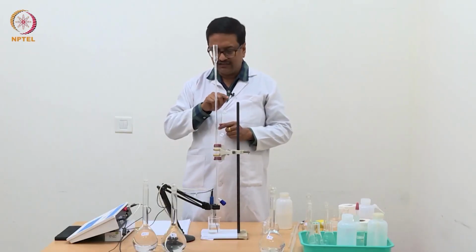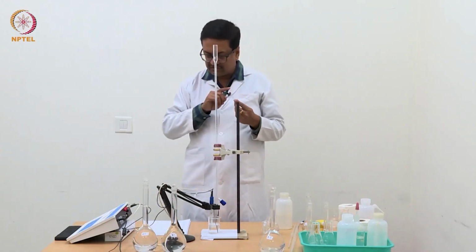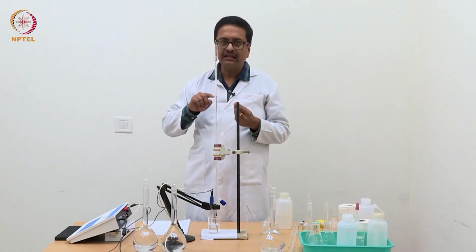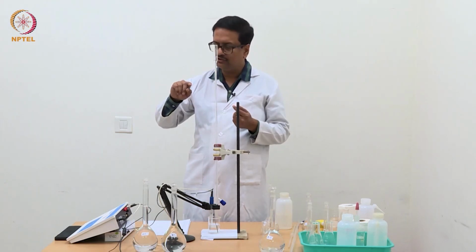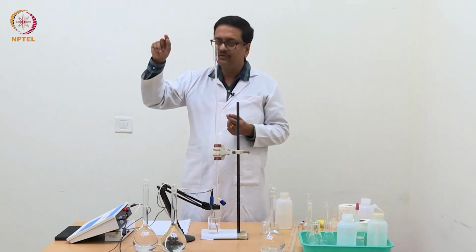So what we started is with 3.74, slowly increased the pH, near the equivalence point it jumped up and then towards the end it has again become flat.